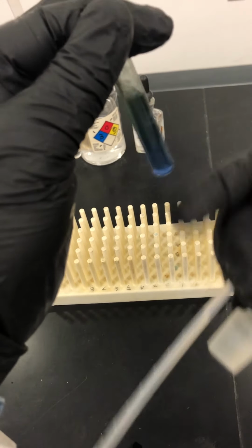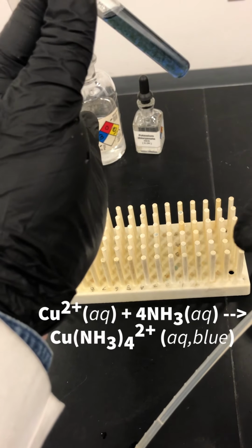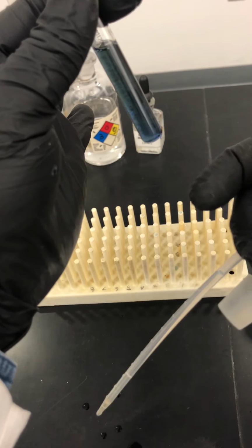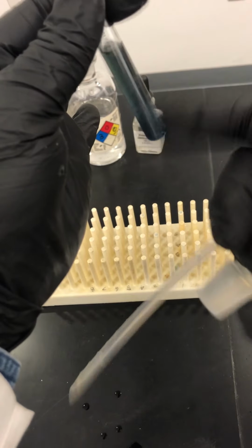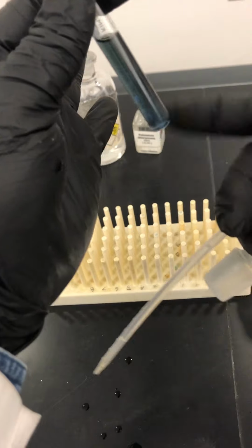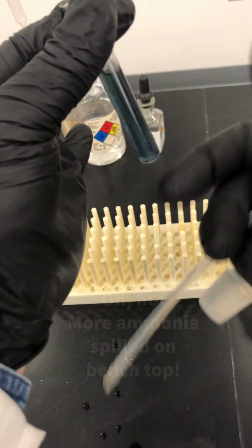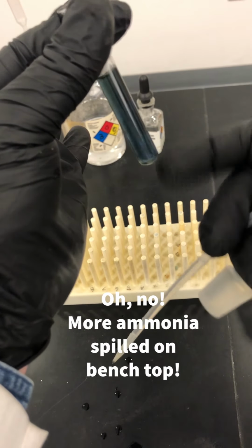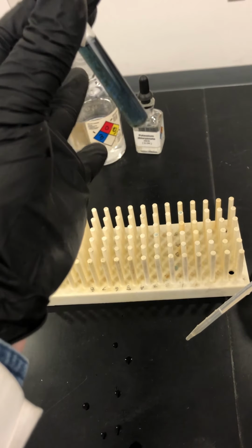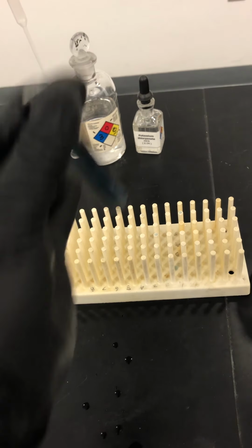There you go. Against the white background, you can see the blue color there. And also what might happen is after a while you might have a competition between the formation of copper 2 hydroxide, because remember, ammonia is basic, so it produces hydroxide ions. So you have a competition between the blue color of the copper 2 ammonia complex and the formation of copper 2 hydroxide. So that is your confirmation for the presence of copper 2 ions in the original mixture.